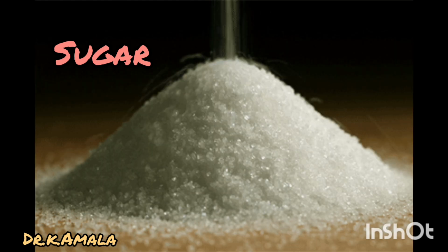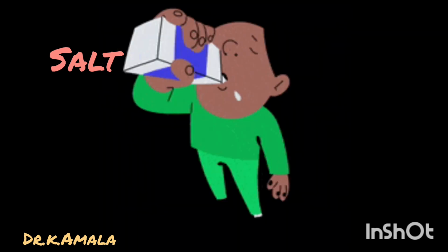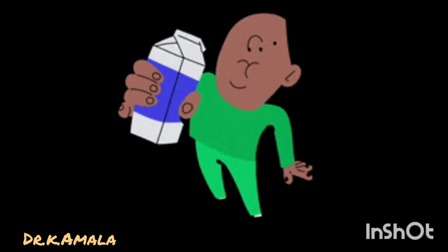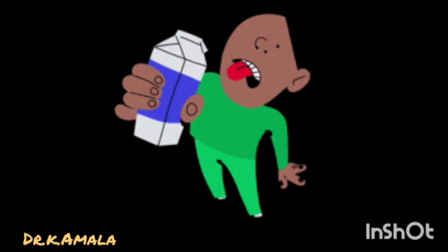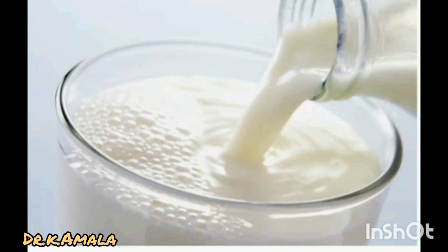And sugar, added to increase sweetness. And salt, added to increase the conductivity of milk. This MBRT detects any contamination or adulteration in milk. It provides a rapid and simple method for milk quality control in dairy industries, farms and laboratories.